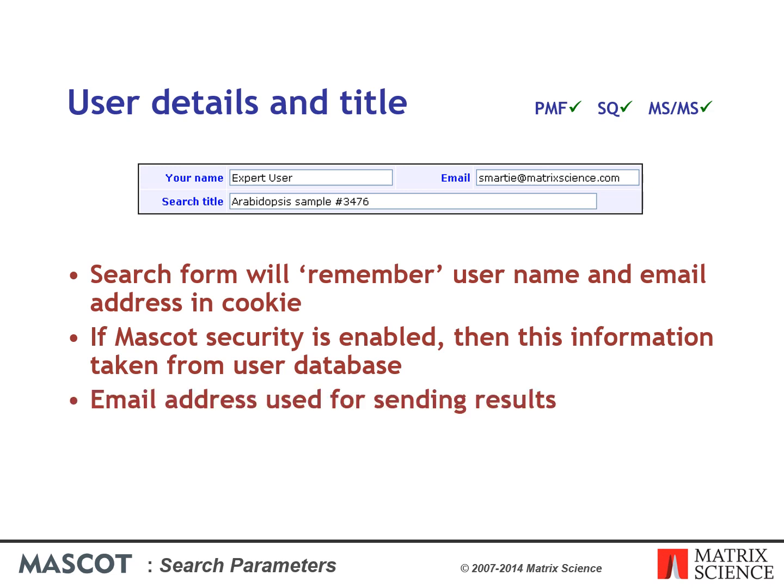When you use the Matrix Science public website, you have to supply a name and email address. This is to allow the results of a search to be returned by email. Usually, search results are returned promptly to your browser window. However, if your connection to the website is broken before the search is complete, they will be emailed to the supplied address. If you have an in-house server, you can enable this if you wish. It is turned off by default.